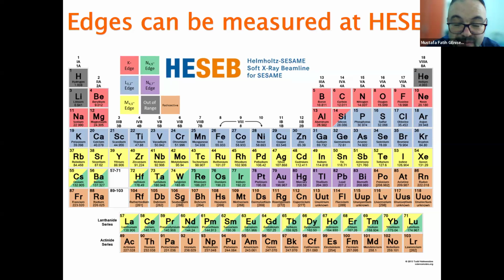When you look at the phosphorus L edges, if it is phosphate, it is not easy to understand. It is very humpy. Sulfur has some good data at the sulfur edges. It gives a very good chemistry about the element, but phosphorus is a headache, to be honest.